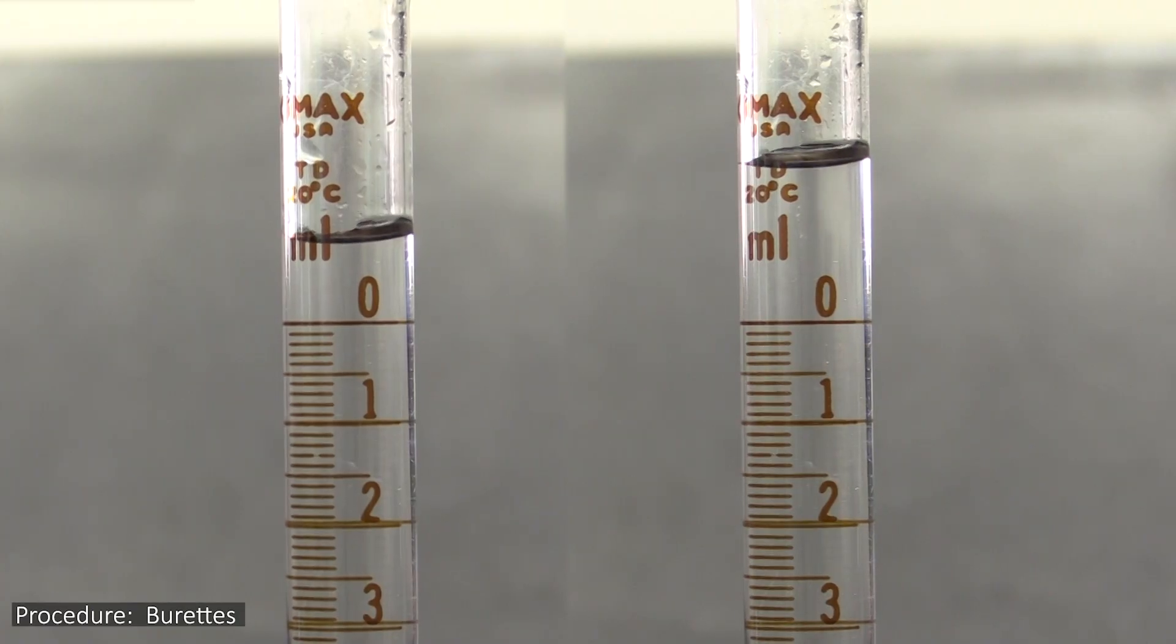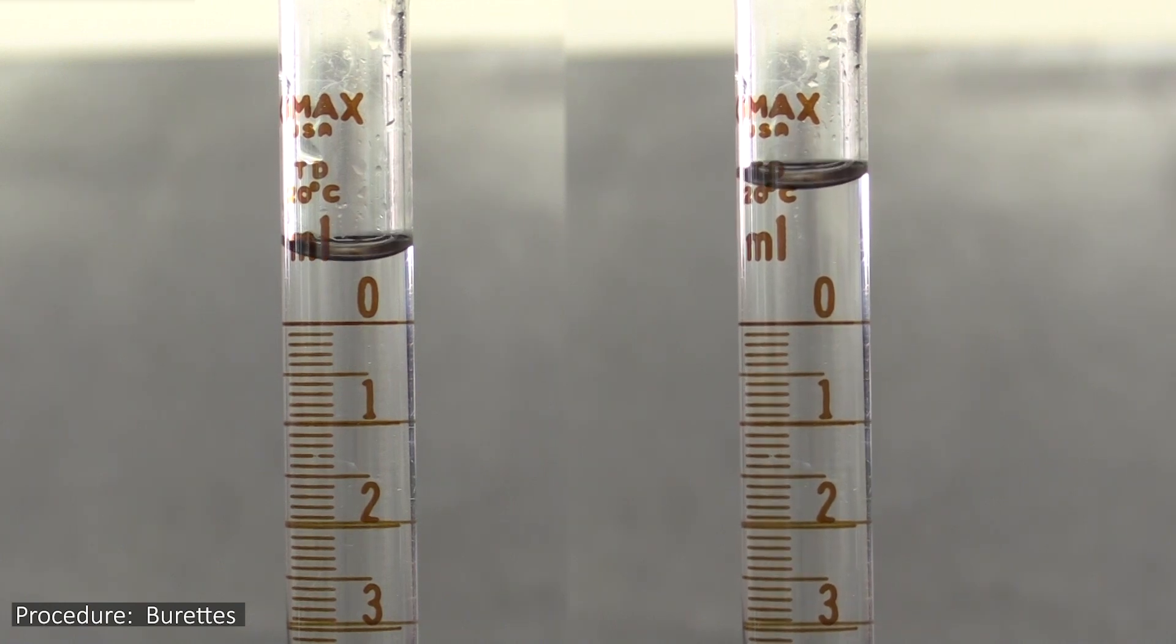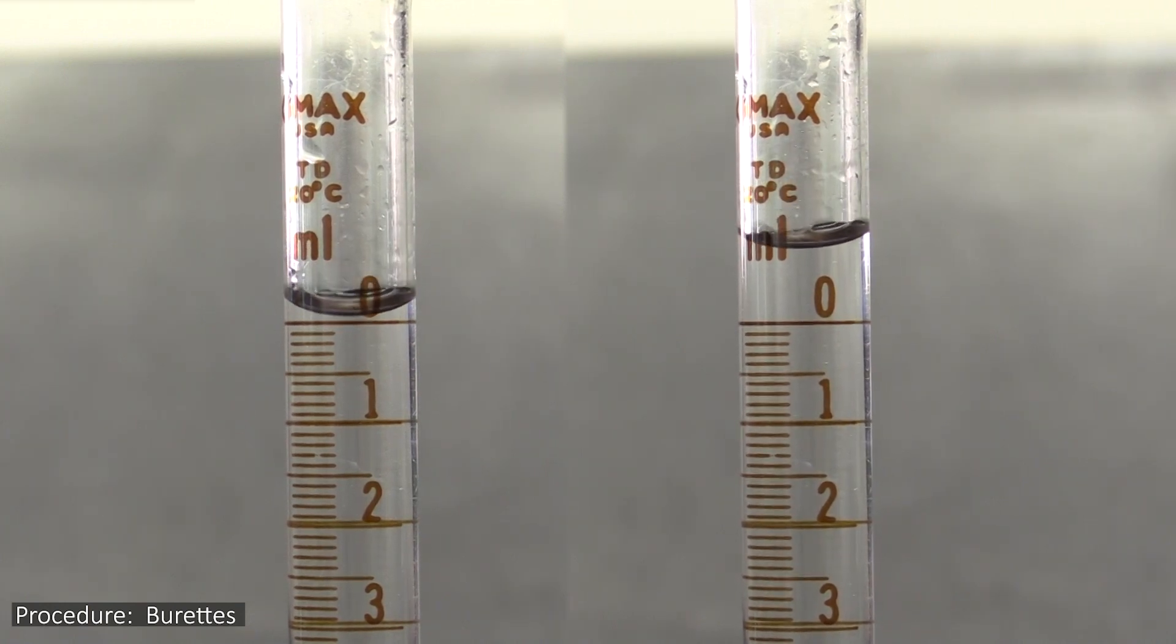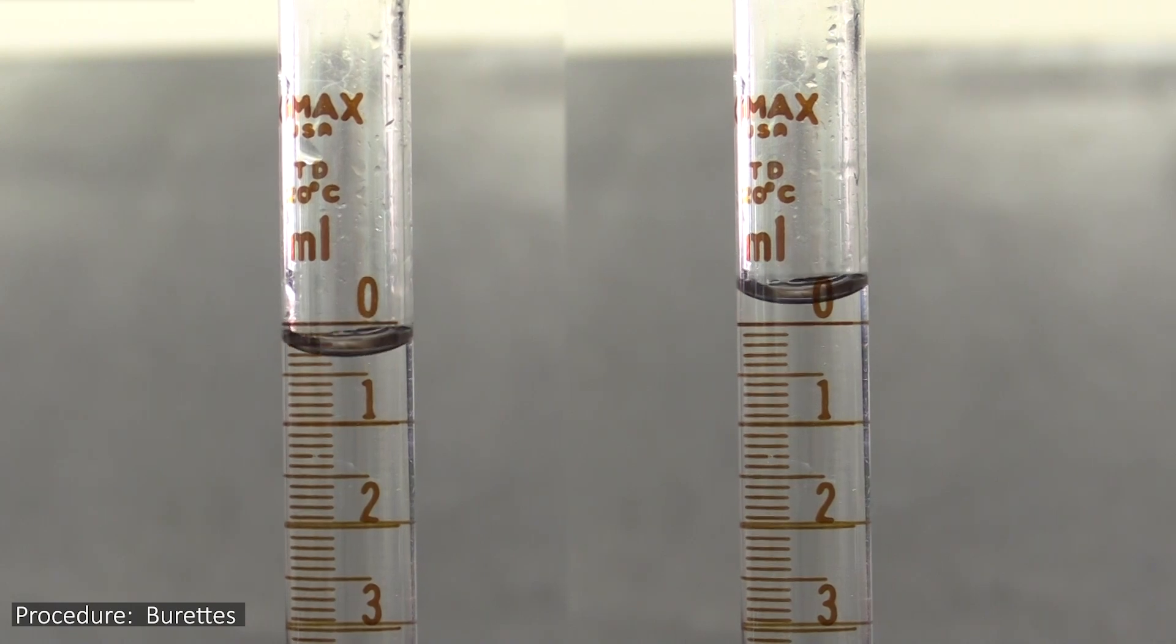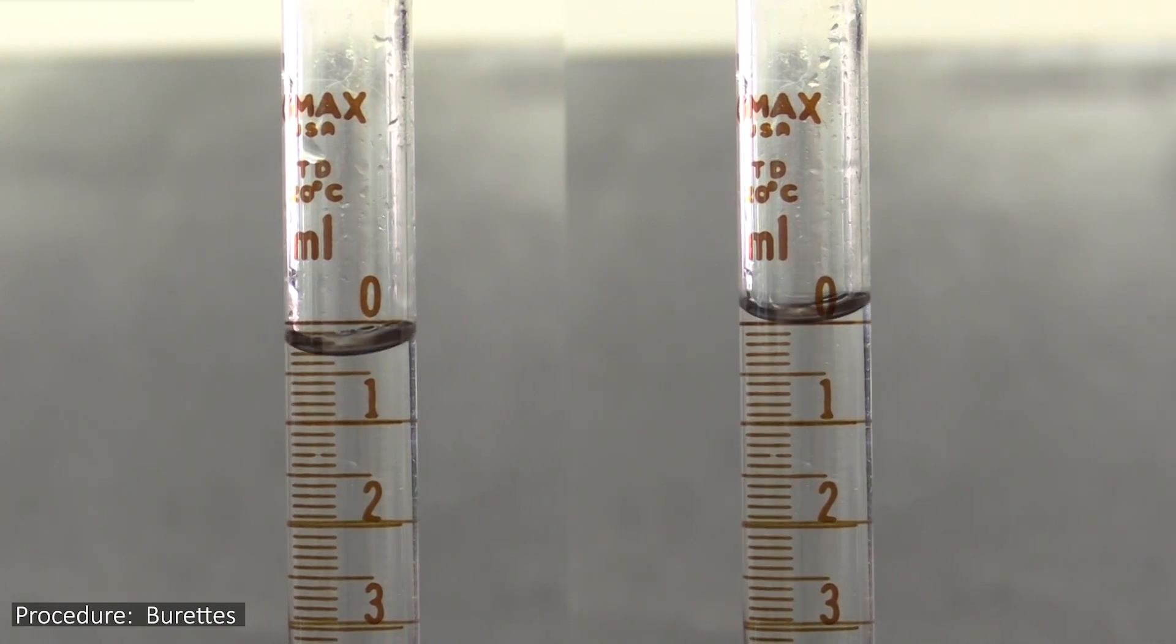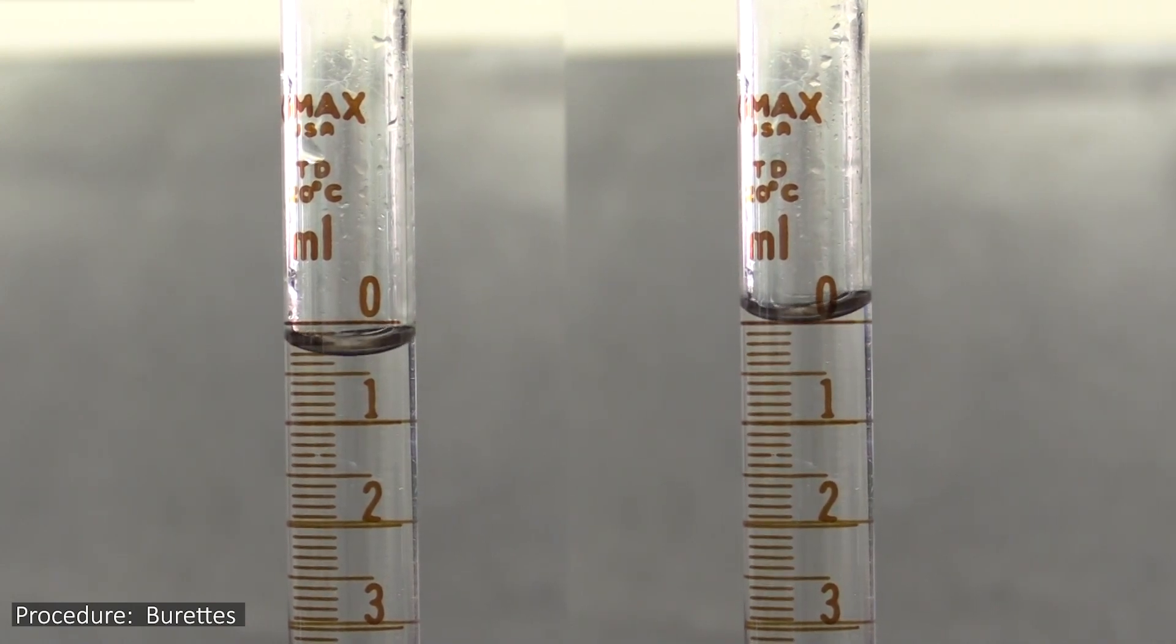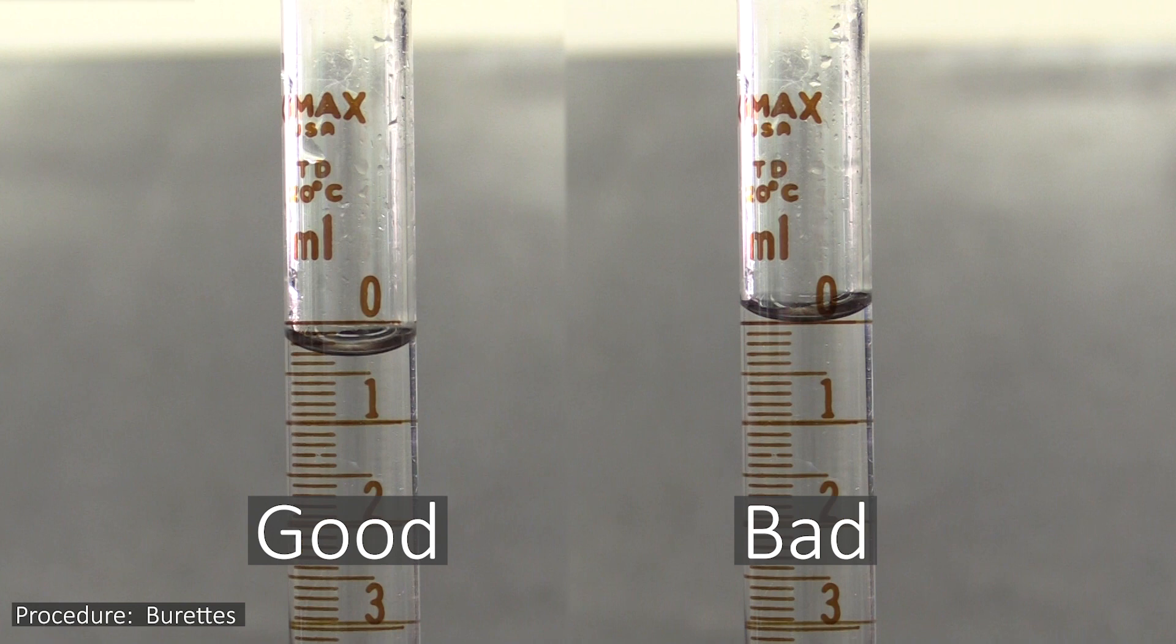Now let's come back to the other reason why you want to drain the fluid below the 0.00 ml mark and not to it. The second reason is because it is hard, and time-consuming, to get the meniscus down to exactly 0.00, to the point that, for all intents and purposes, it doesn't happen. So if you are truly reading the meniscus properly, you won't have any 0.00 ml readings.